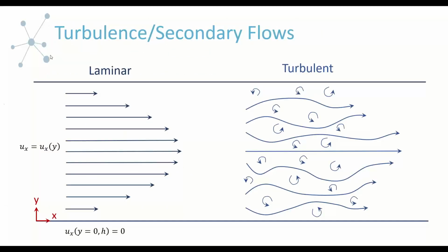On the left, we have what we typically draw when we do our viscosity review, and we're looking at the flow field or velocity profile in our flow channel. As we stated before, these are all velocity vectors. They're all parallel, all moving in the same direction, so laminar unidirectional flow. What can happen, however, depending on the nature of your material in combination with the flow conditions, is you can have this transition to turbulence. Now this is a much more chaotic state, and we have streamlines that aren't parallel at all times. They're not moving in one direction. And then you can also have the presence of these eddy currents.